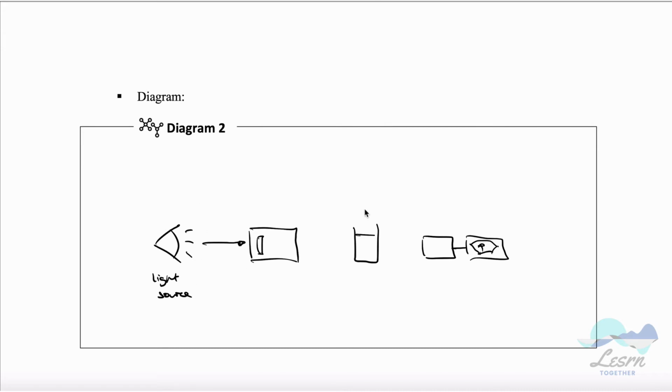But if our sample solution has a particular color, we want to pick what we call the complementary color, which is the wavelength that the sample absorbs the most. So what I mean by that is, if this sample solution is green, for example, then this object here, which is what we call a color filter, we want a purple color filter. So it's almost like a slit with a bit of cellophane through it.